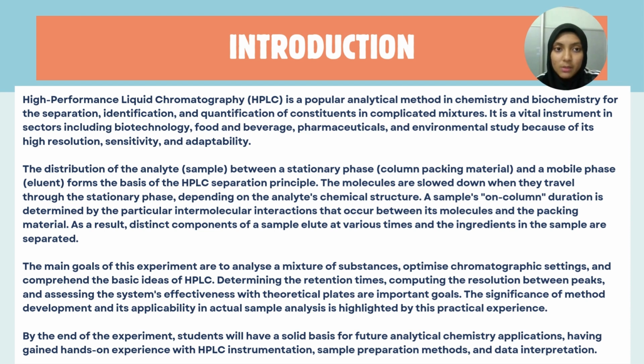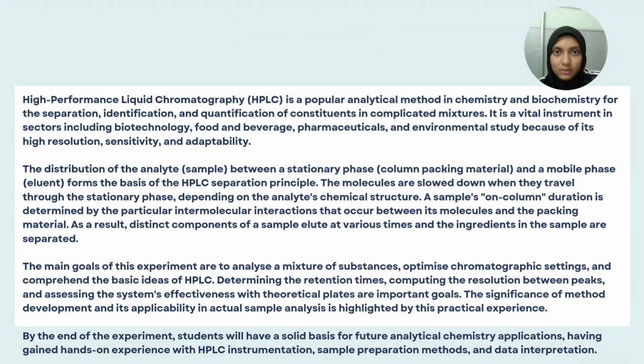The main goals of this experiment are to analyze a mixture of substances, optimize chromatographic settings, and comprehend the basic ideas of HPLC. Determining the retention times, computing the resolution between peaks, and assessing the system's effectiveness with theoretical plates are important goals. The significance of method development and its applicability in actual sample analysis is highlighted by this practical experience. By the end of this experiment, students will have a solid basis for future analytical chemistry applications, having gained hands-on experience with HPLC instrumentation, sample preparation methods, and data interpretation.